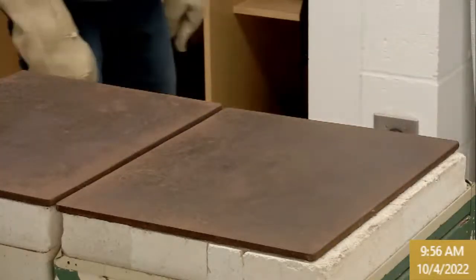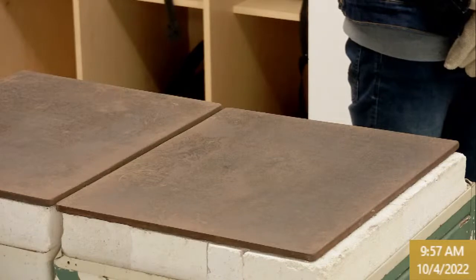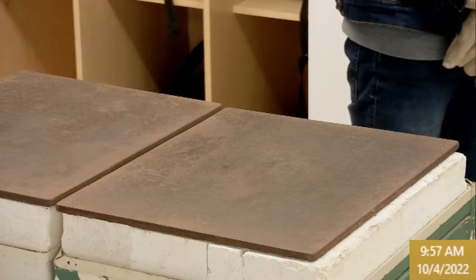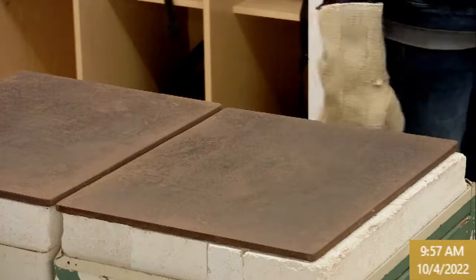So, all right. This first glass is silica beach sand. This is the Lake Michigan sand. We've got 2.5 grams of aluminum oxide, 50 grams sodium carbonate, 26.8 grams calcium carbonate, and 0.49 grams of copper oxide. So batch A, and we're pulling from the front left.